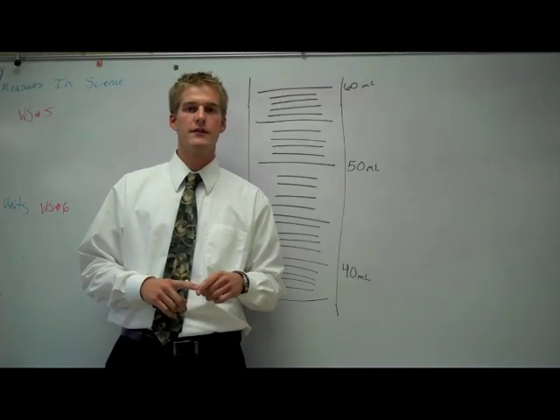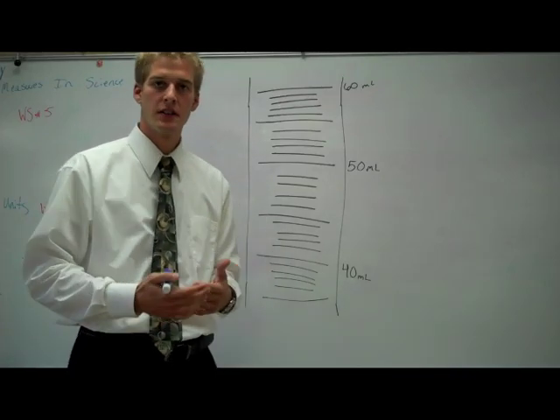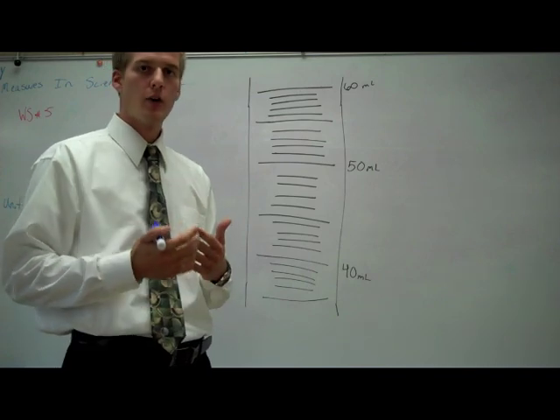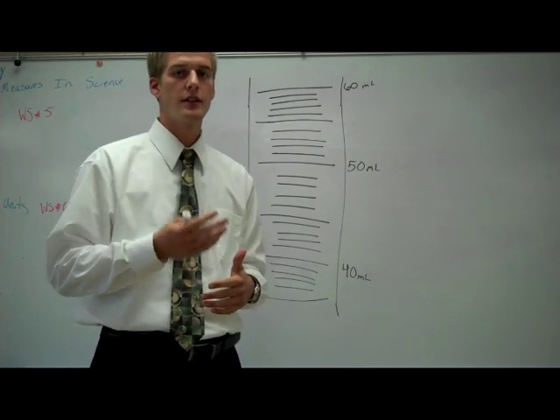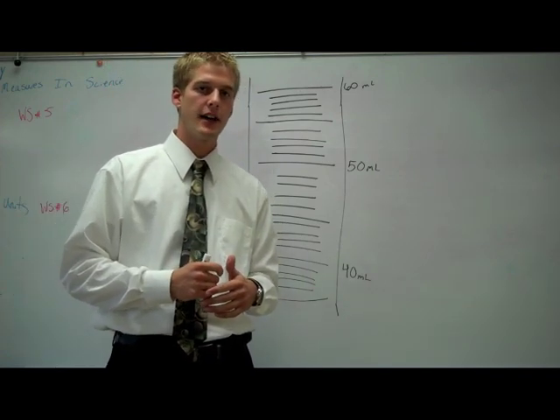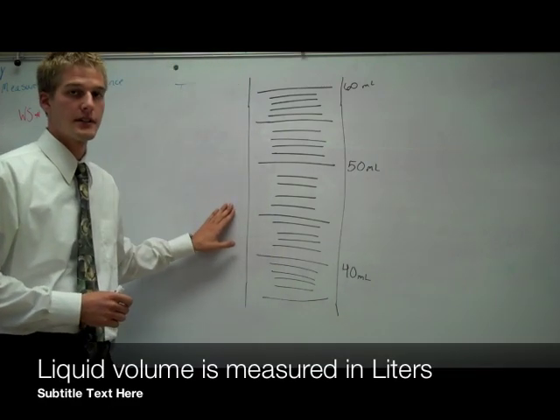Alright, so today we're measuring liquid volume, like water, different types of liquids. We're going to use blue food coloring to dye our water to see our graduated cylinders later in class. But today, this is the graduated cylinder we're going to use.